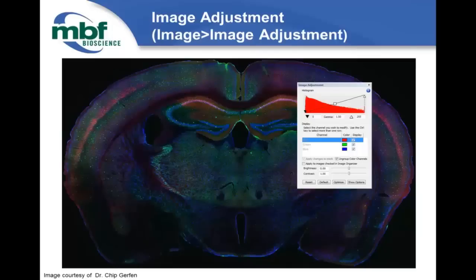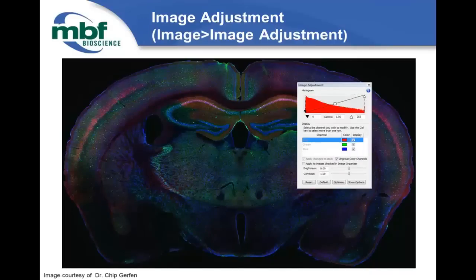First, we're going to talk about image adjustment. Typically when you first load an image into our software, you may need to adjust it. To do any adjustments, go to Image > Image Adjustment and this dialog will appear. In this dialog, you can adjust the dynamic range — the dark point or the white point — to help make items pop or make the signal a bit brighter. You can also adjust the brightness and contrast. In this example we have a multi-channel image with three channels: red, green, and blue.